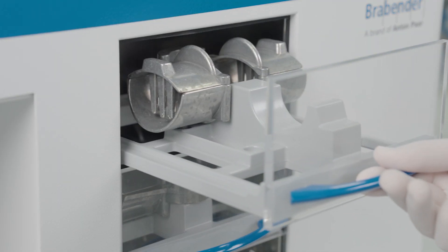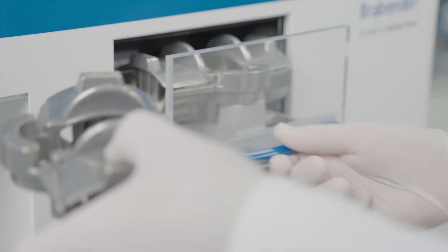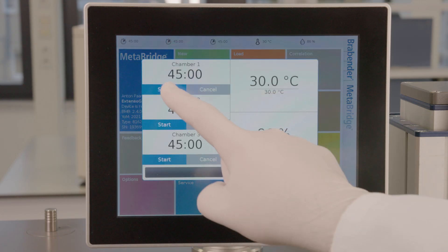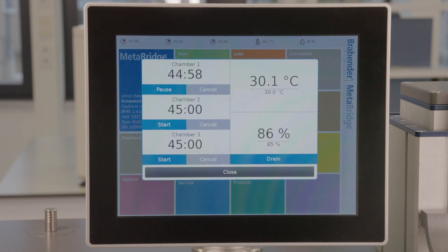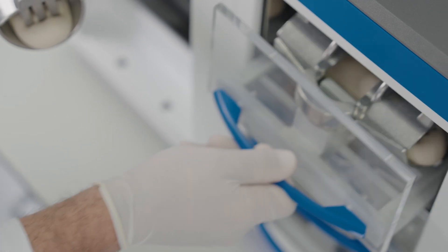Place it into the fermentation cabinet and start the timer. Repeat the procedure with the second piece of dough.